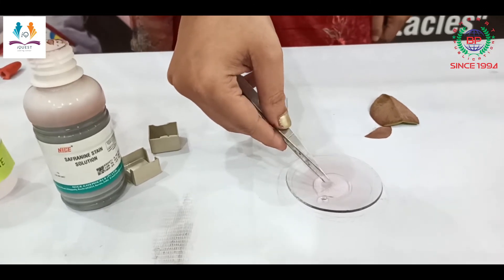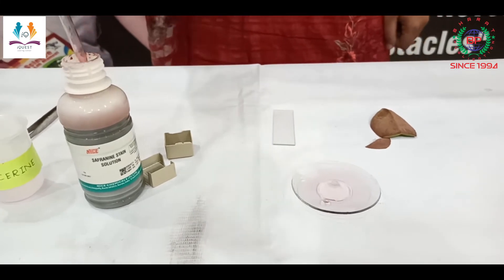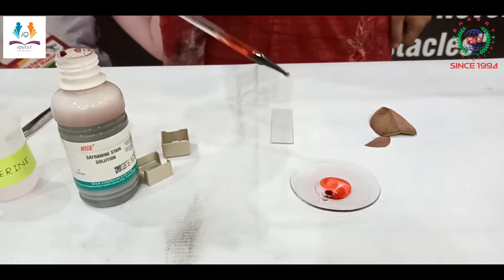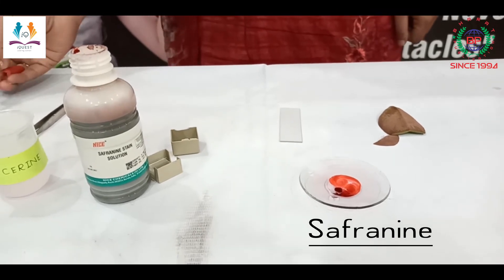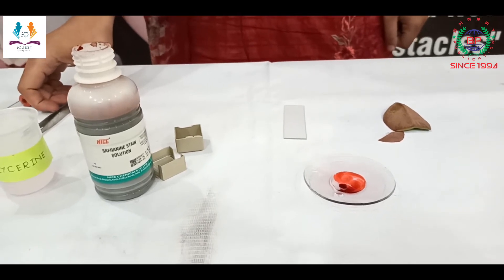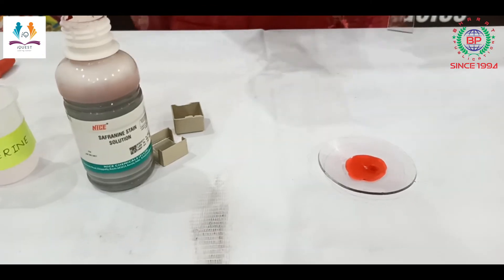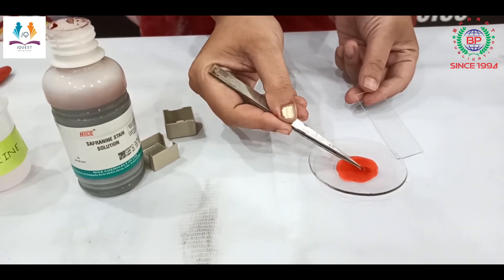Now I have to add a drop of safranin into it so that this peel gets the color of the safranin, as it is transparent. Now keep this undisturbed for two to three minutes.